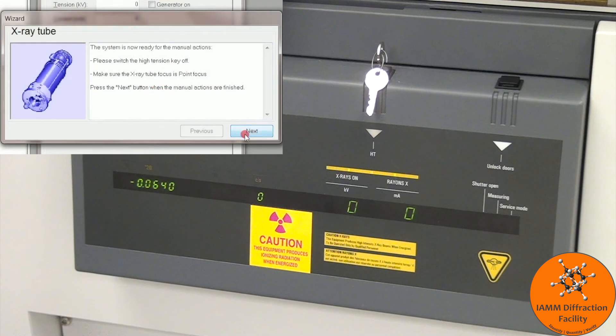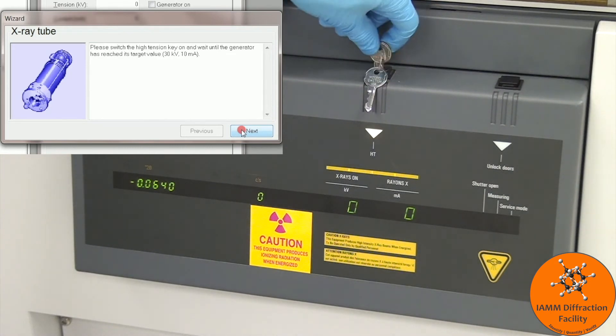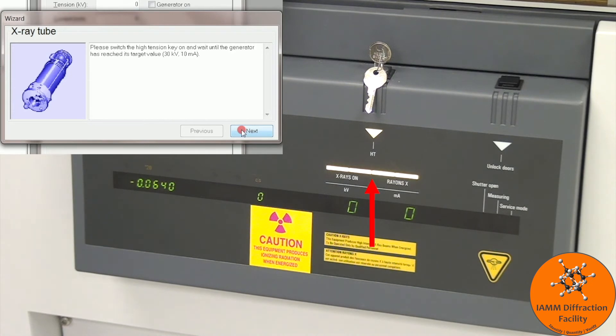We are now in point focus, so I can click next. This says to turn the high tension key back on, so I will turn that. There we see the lights come back on and then the numbers should start increasing in a moment. They will start out at 15 and 5 and then increase to 30 and 10.